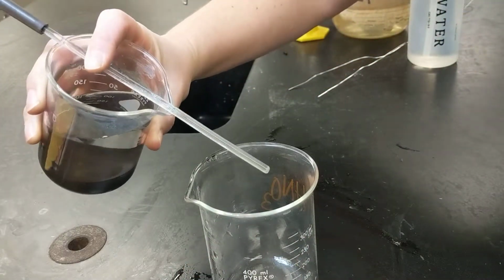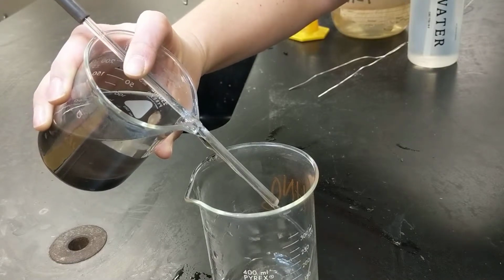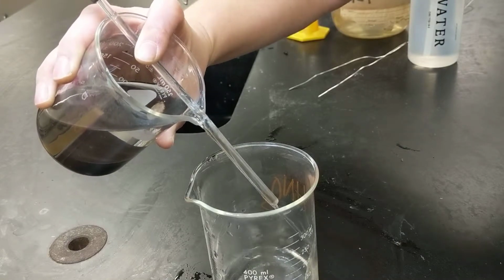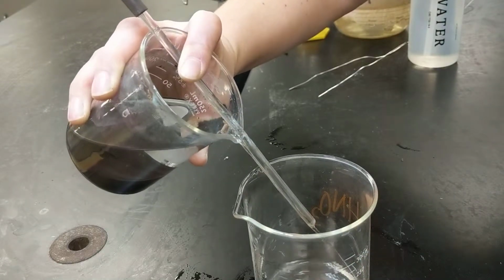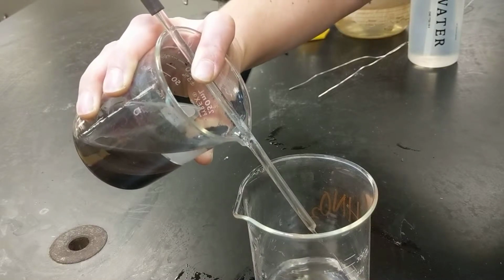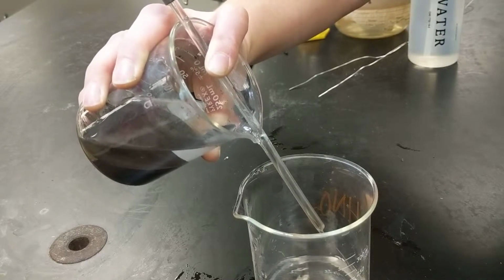I'm going to pour, and the liquid is going to come out, but my solid is going to stay at the bottom. And you want to do this really carefully, so that you're not disturbing any of the solid at the bottom.